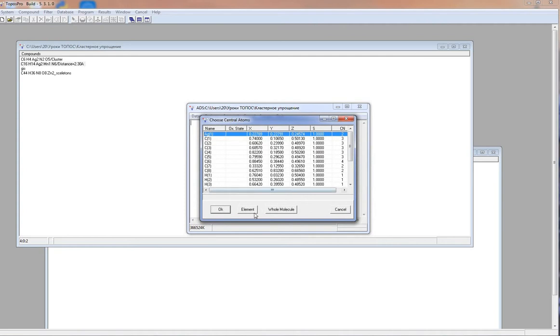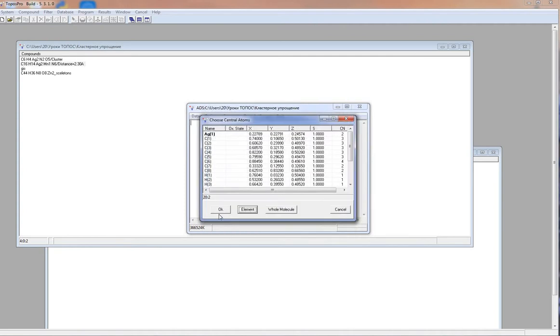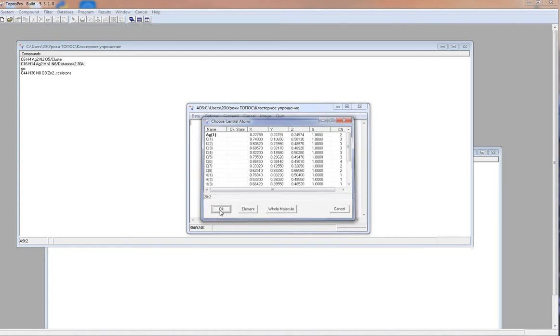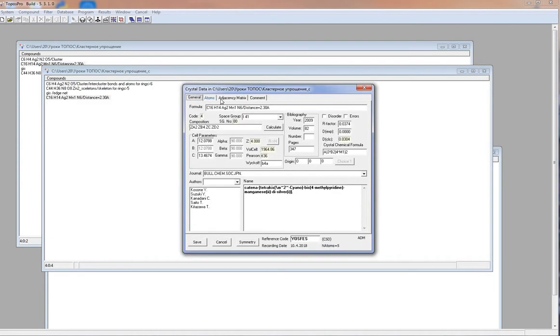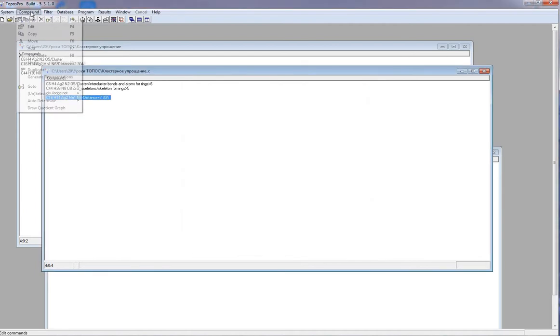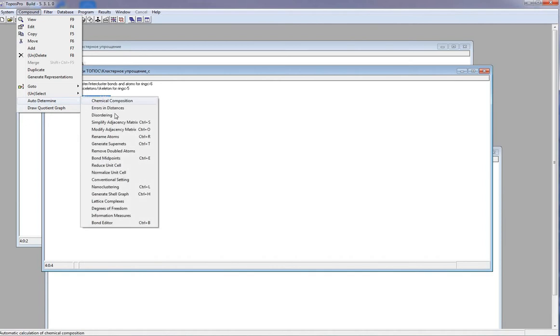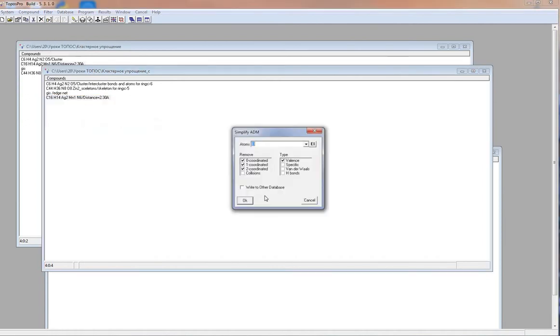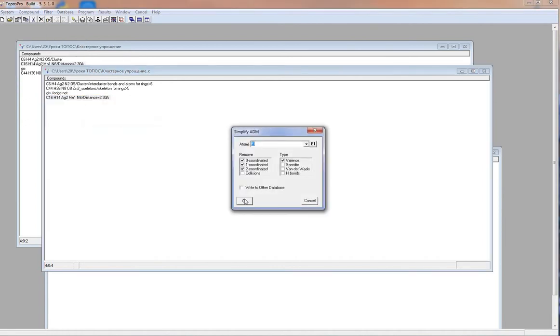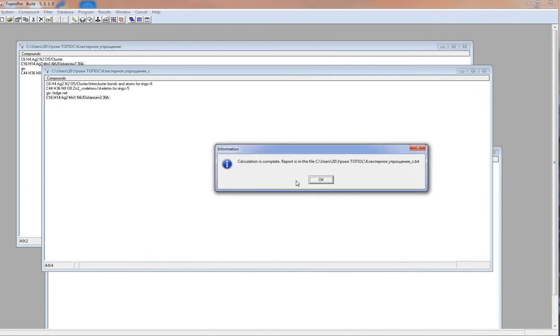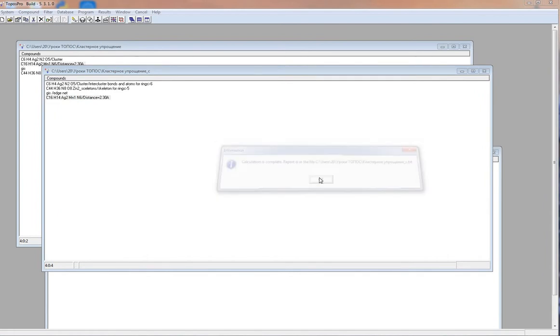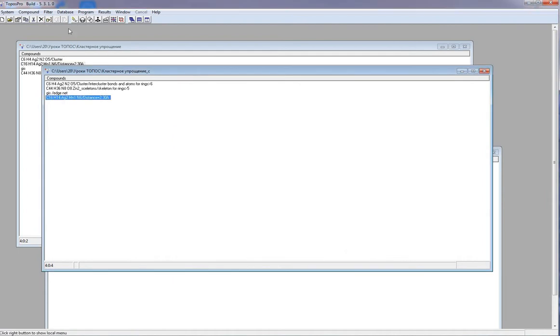Since it is metal complexes, as central atoms, I should choose metal atoms. We have 5 different nodes. But we should delete all 0, 1 and 2 coordinated nodes. So I open compound, auto-determine, simplified adjacency metrics, remove all 0, 1 and 2 coordinated nodes. Now we have only 4 coordinated nodes. We can look at the structure.